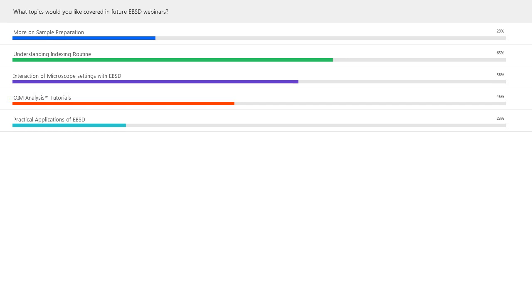So NPAR is a reprocessing of the actual patterns themselves, while the cleanup routines tend to be more like image processing routines. So NPAR should be done before any cleanups are done. Those cleanups should be done after NPAR.